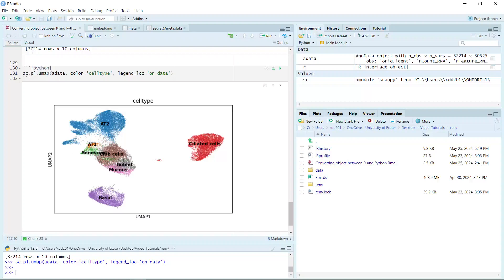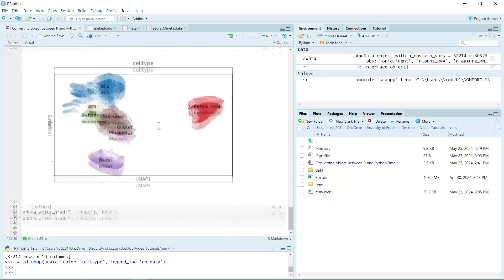You can see it is very easy in R Markdown to convert a single-cell RNA sequencing data object between R and Python. Now we have created the AnnData object, and we can use the AnnData write_h5ad function to save the data.